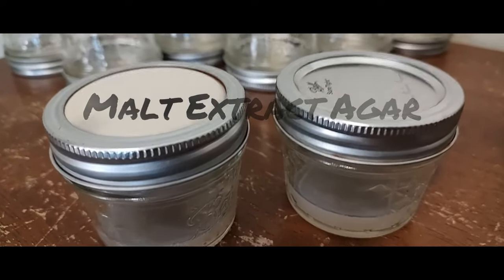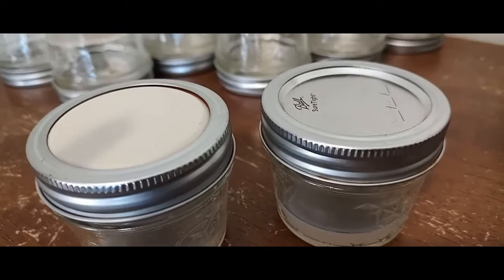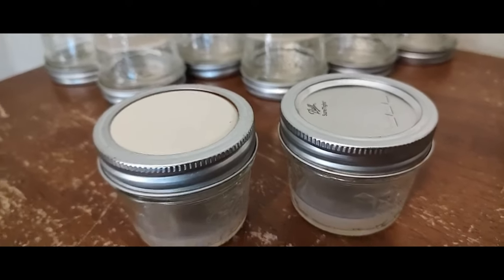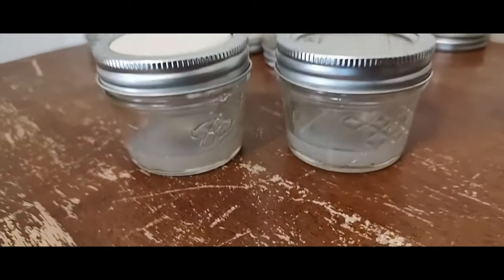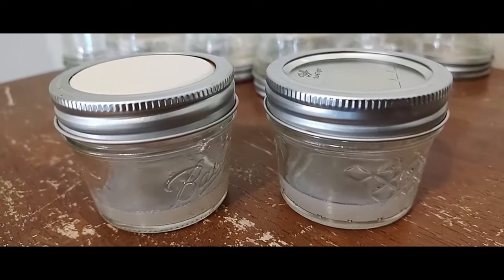MEA or malt extract agar is the go-to agar recipe for home mycologists. It provides the perfect adjustable recipe for growing out contaminant-free mycelium cultures.